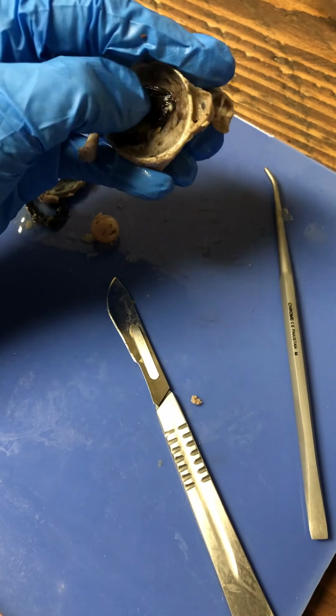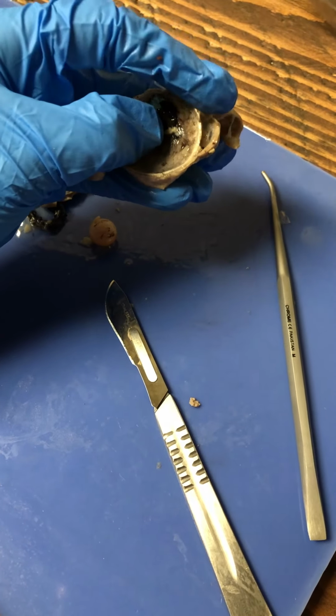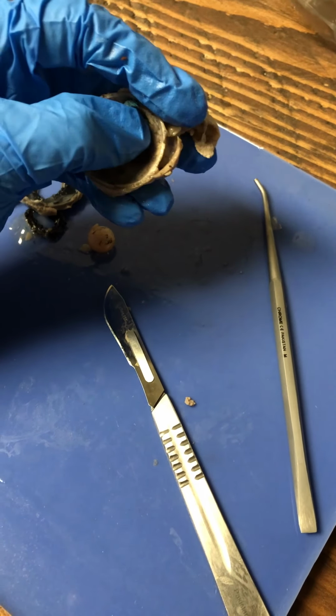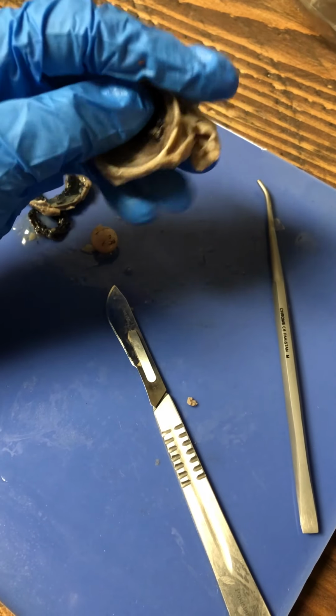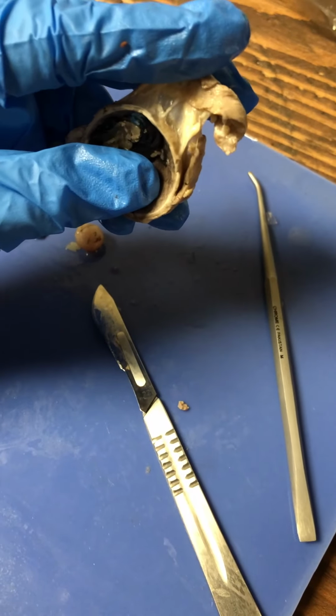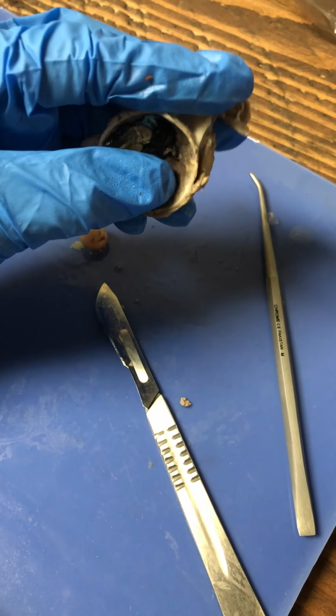And if you move this, you can see where it's attached, and that's where the blind spot is. And the blind spot is where the receptor cells converge to form the optic nerve, and then the optic nerve is obviously right behind it because it connects with the blind spot.